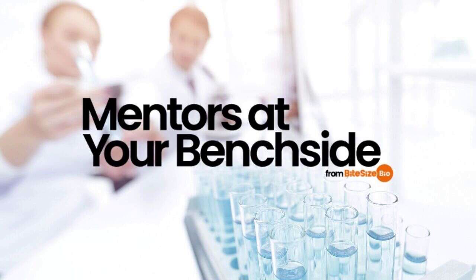And because we care, here are some bonus Ponceau S staining tips. Don't forget to check the signal on both the top and bottom of the blot. The proteins don't transfer equally to both sides, so a weak or strange looking signal may mean that you're looking at the wrong side of the blot. It sounds obvious, but sometimes the most obvious answers are the last ones we think of in the lab. Especially when you're running on less sleep than is ideal and you really need this blot to work.